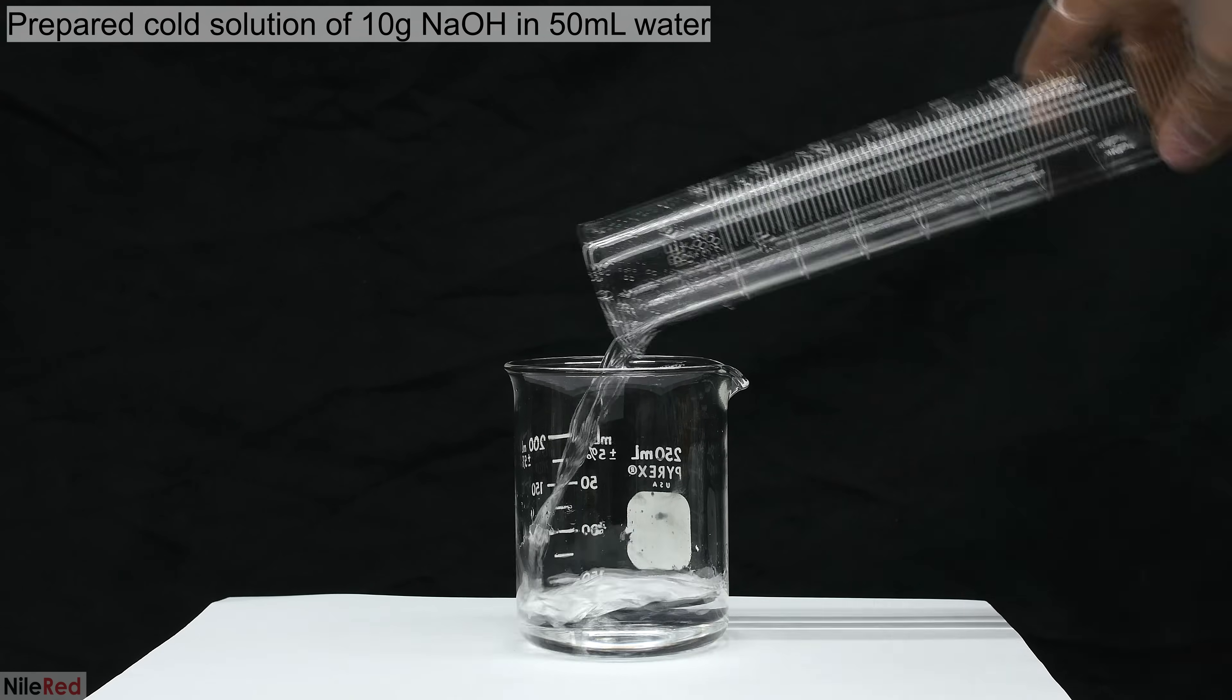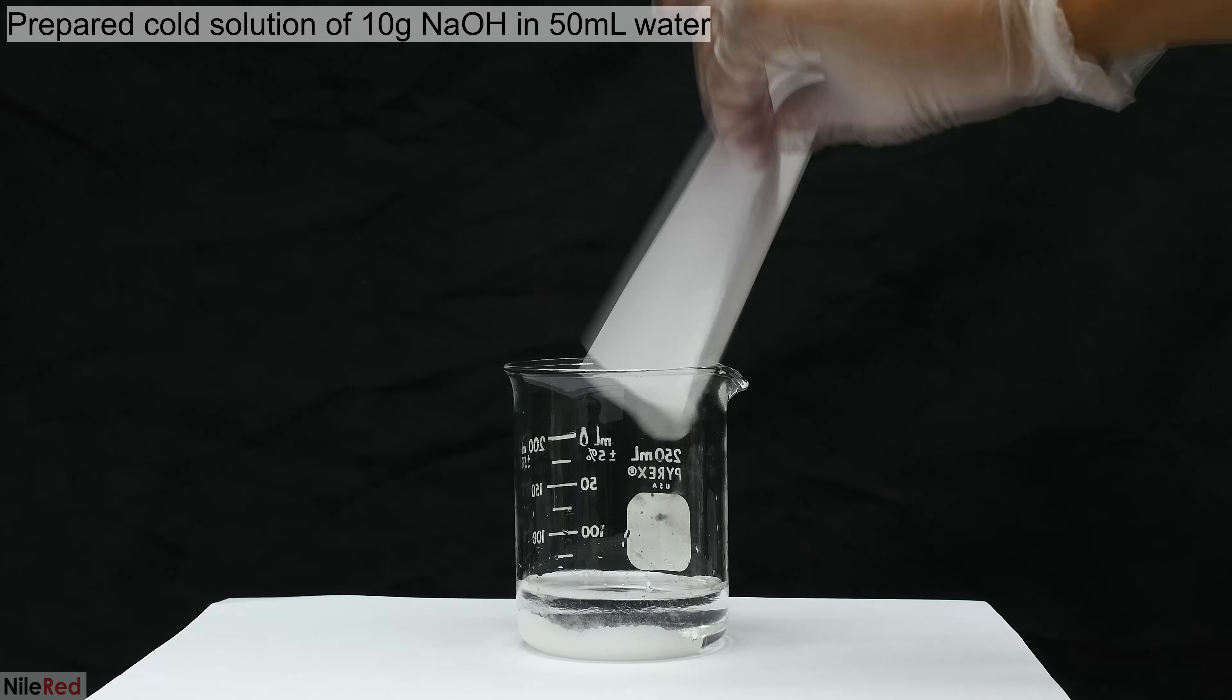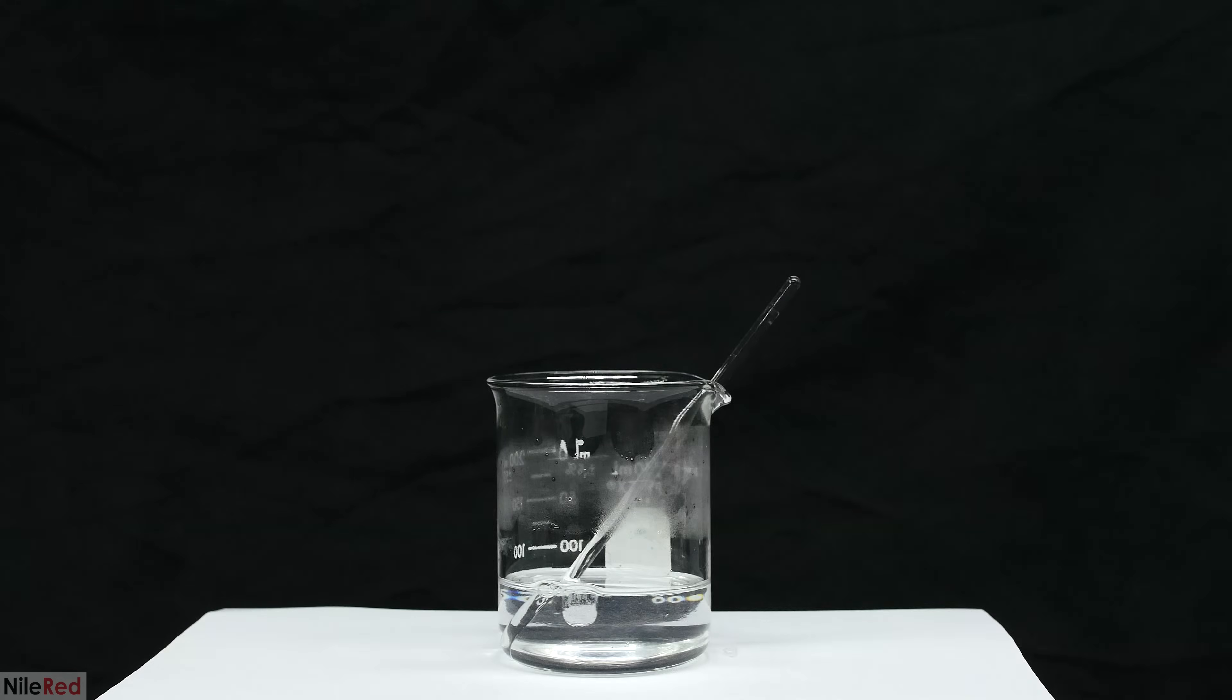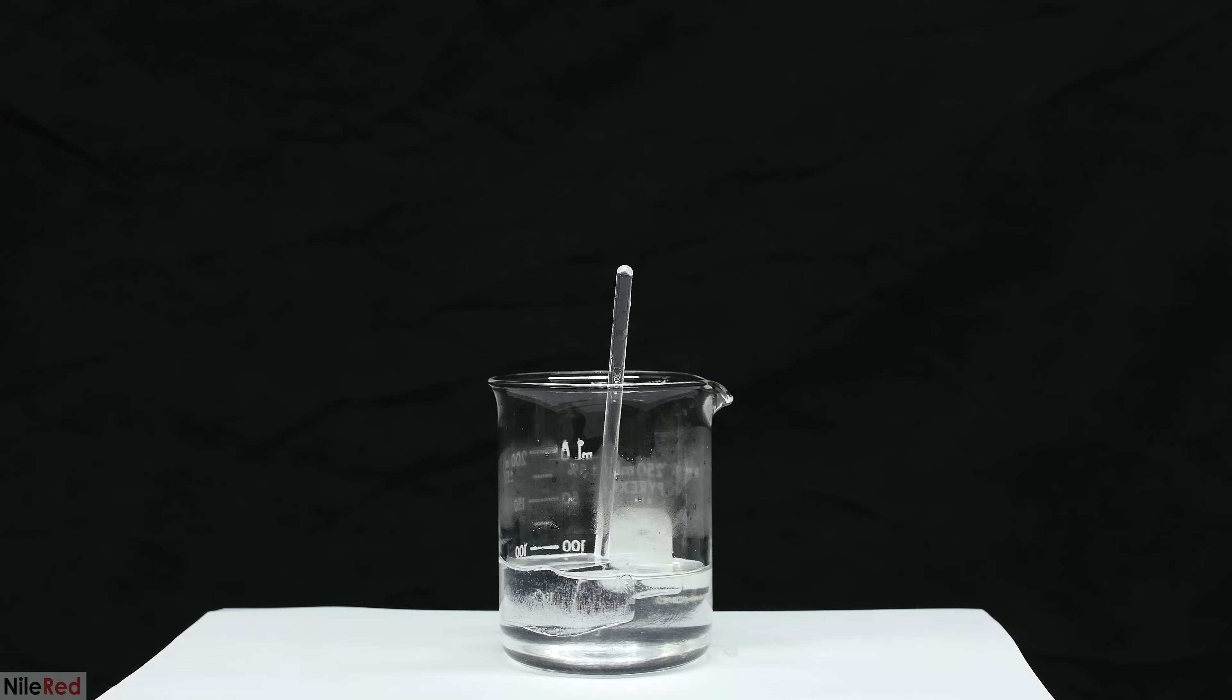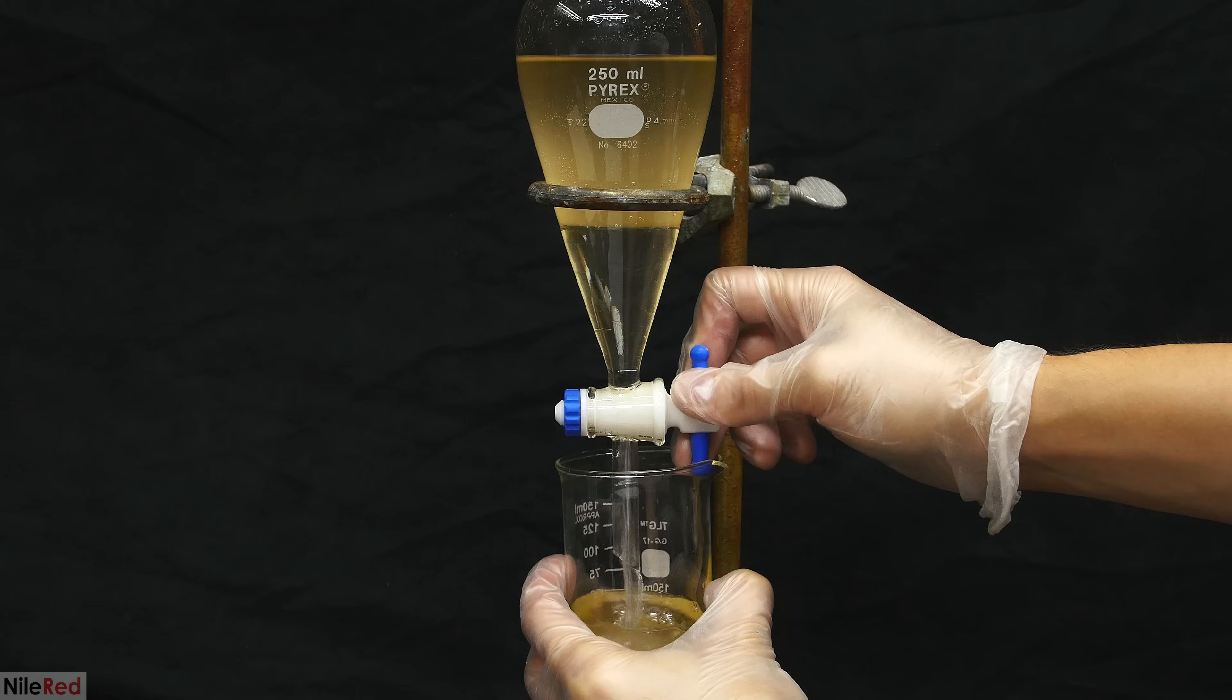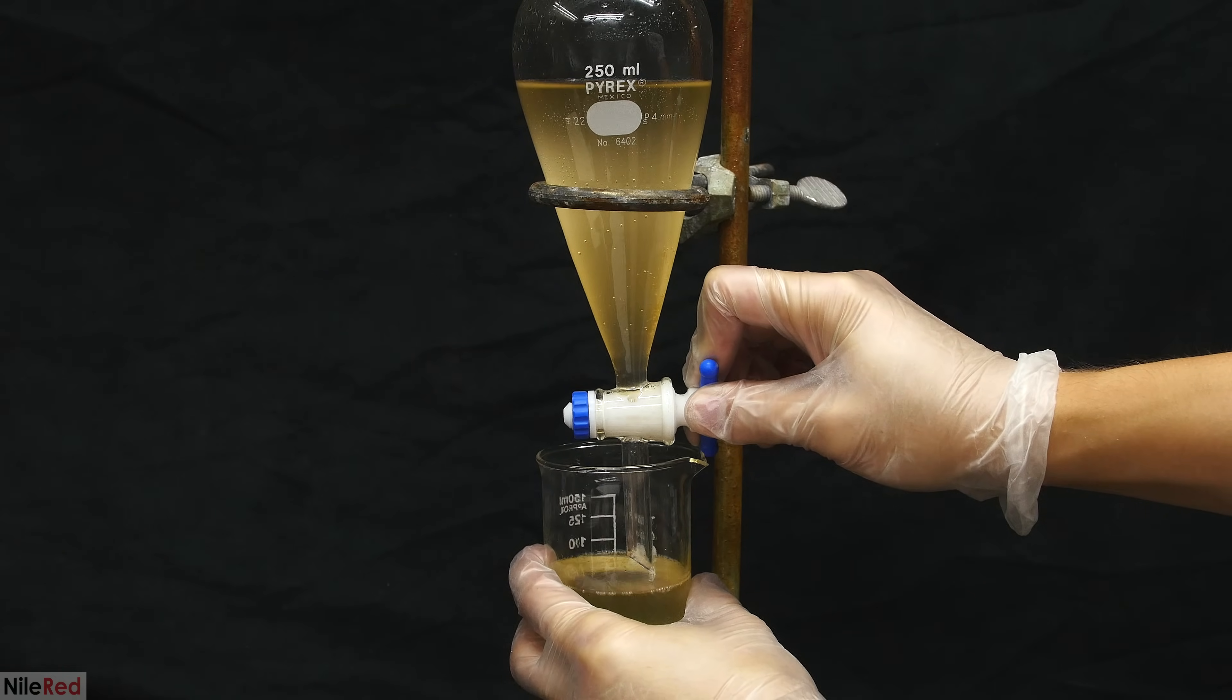In the meantime, while we wait for the layers to separate, I prepared a cold solution of 10 grams of sodium hydroxide in 50 milliliters of water. This preparation was pretty easy, where in the first step I dissolved the sodium hydroxide into the water, and once everything was dissolved, I dropped in a few ice cubes. Now we come back to the separatory funnel, and the layers have separated, so I carefully removed the lower DCM layer. The DCM washing that I drained here was combined with the anisole that I collected earlier.